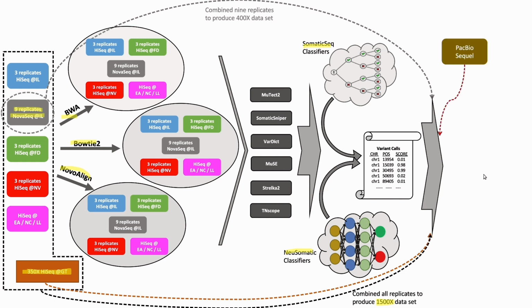Finally, we used PacBio long-read data to remove a small number of mutation calls in low mappability regions when short-read and long-read data contradicted.